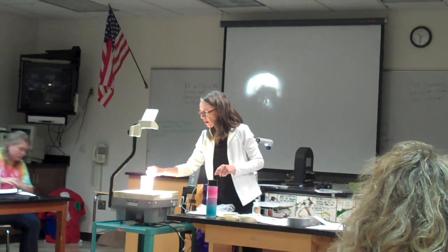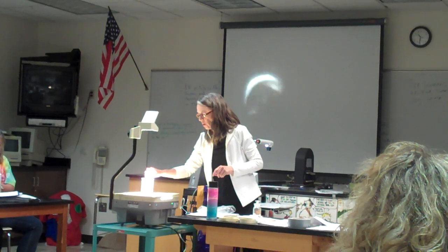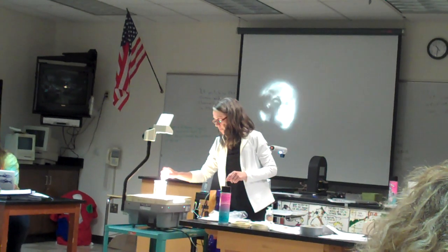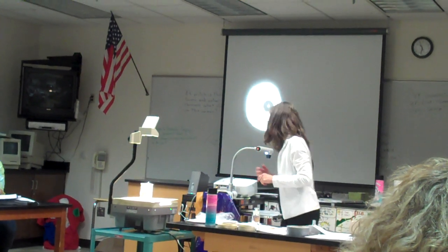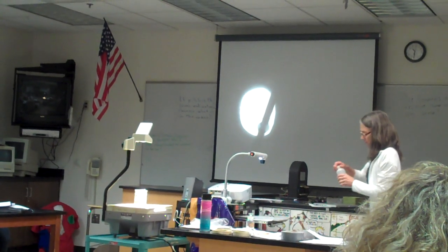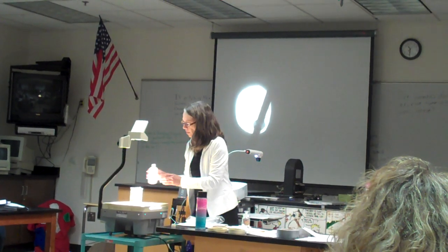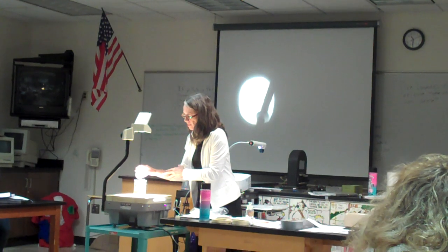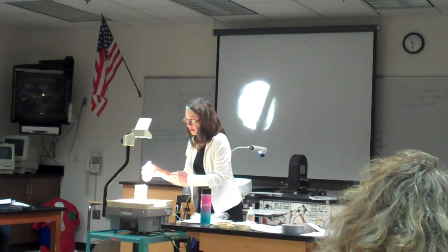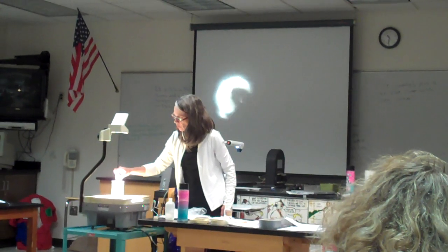I'm now going to add dilute hydrochloric acid. Half a molar, 0.5. And the reason I do that is because it makes a suspension. And I'm going to add some. I would say that was a tablespoon, and that's a tablespoon. It just determines how quick the reaction goes.